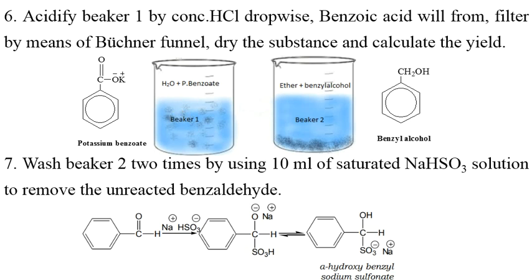Now let's purify the beaker number 2. Let's talk about purification of benzyl alcohol. To this beaker, add 10 ml of saturated sodium bisulfite to remove unreacted benzaldehyde.